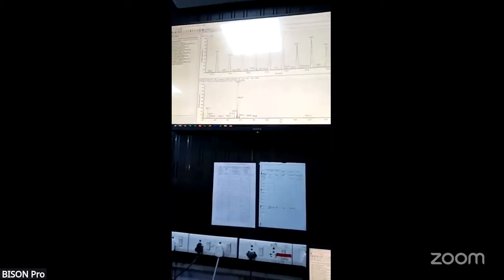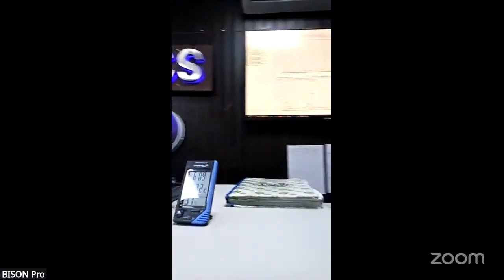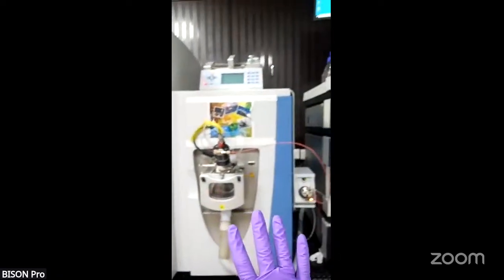Once the data is generated, we can analyze it with MSFragger or other routinely available free software such as DIA-NN. This data will now reveal what all proteins have been isolated through global discovery, as the Professor said. One more instrument which is very robust is the Q Exactive.